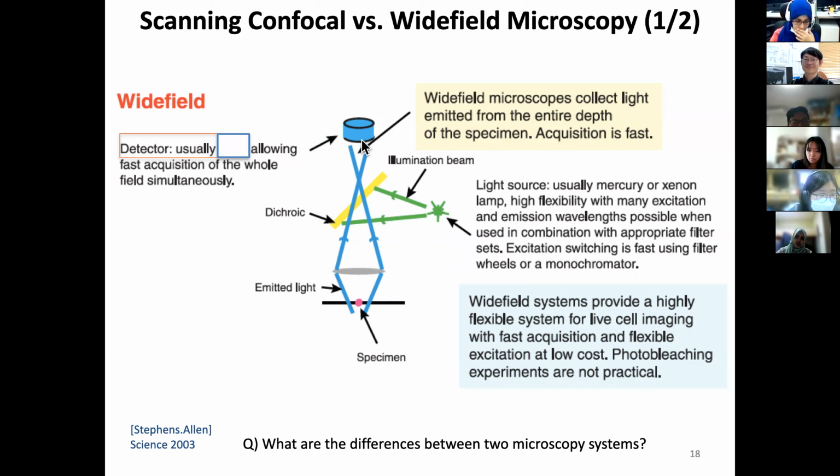I forgot, Professor, but I have seen that. Yes, it's simple. You are using a camera over there, right? So that's a camera. And here I put a CCD camera, or charge coupled device, which actually got a Nobel Prize for this invention. But now in science, we are using more CMOS cameras, which are more advanced nowadays. Okay, so you are putting a camera over here, all right?